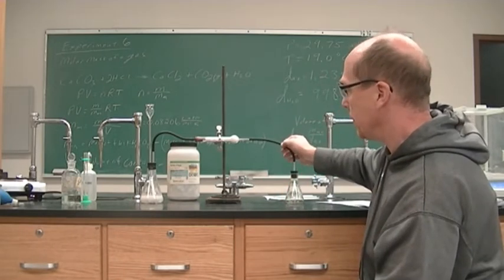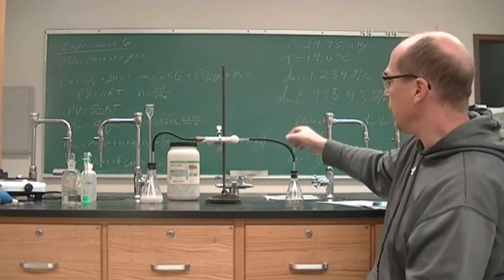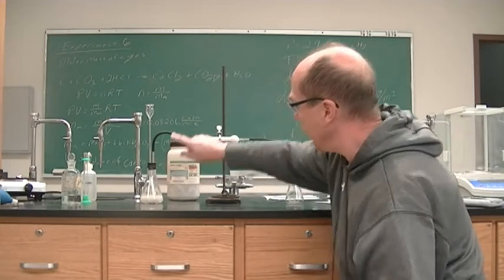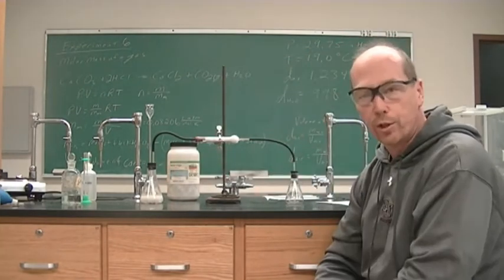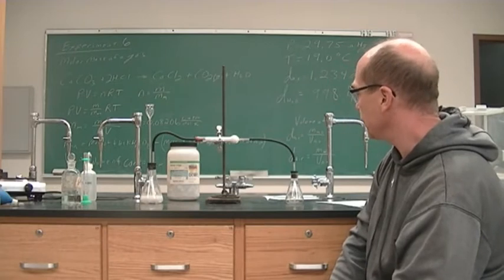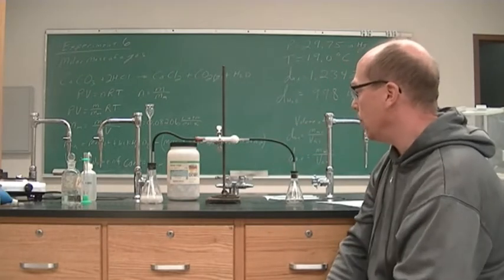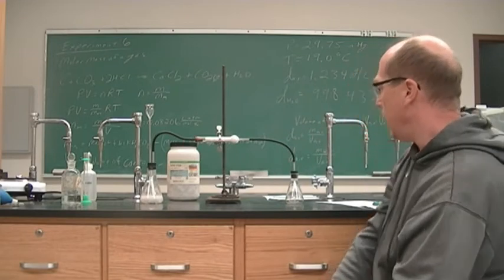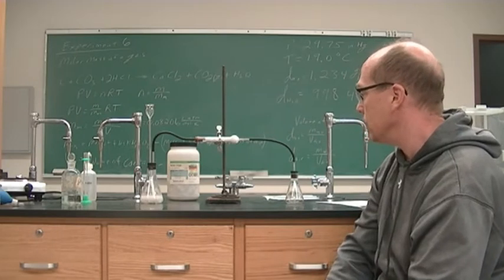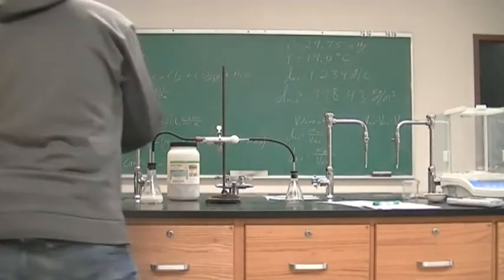Again, we got plenty of CO2 coming over. And when you pinch this and that goes up that rapidly, you know what volume is coming over here. It is a pretty good volume of CO2 that is being produced, and it is definitely getting into our flask here. I have the balance right next to us ready to weigh our flask with the CO2.